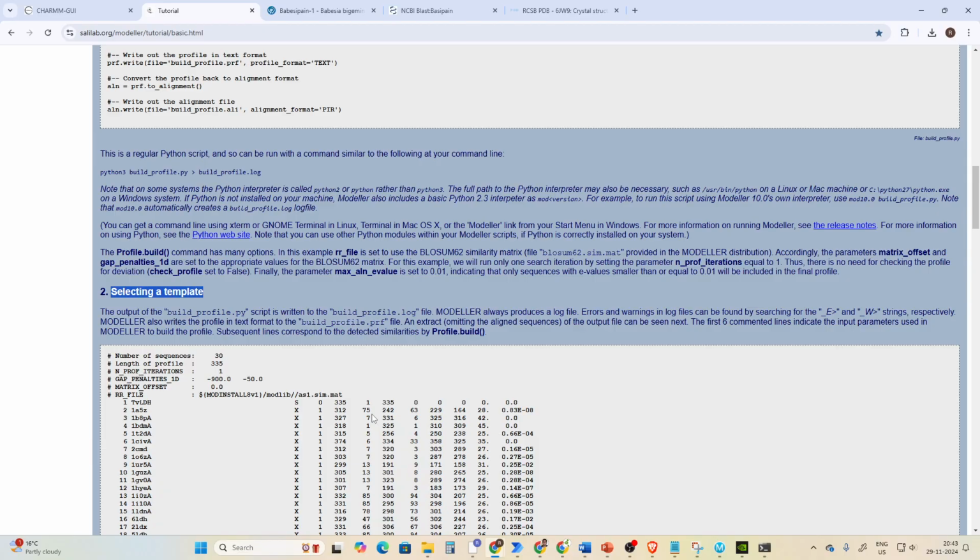The sequence coverage should cover the particular domain that you are interested in. If it is covering the whole structure, then it's fine, you can just take it. And if it is present in different organisms, you should look for the organism source which is closest to your target protein or enzyme.